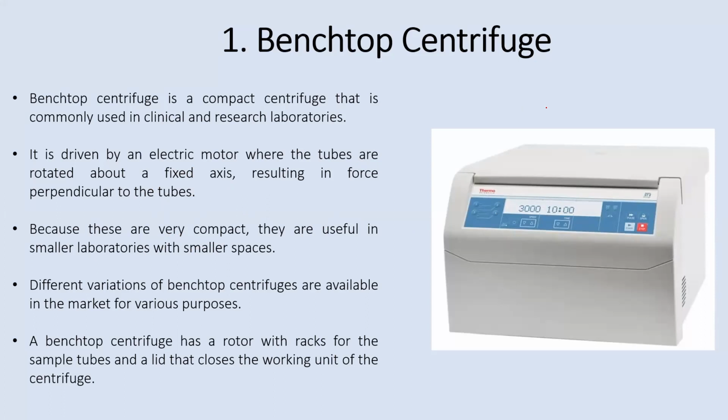So this is sheer out of necessity: how do we get a centrifuge in the lab when the space is not so great? So what do we do? We can go for a benchtop centrifuge, and different variations are also there. And as I said, there are so many other companies. They will have different models, so you have a lot of choice depending upon what capacity you can afford to buy. This is from the Thermo Fisher company.